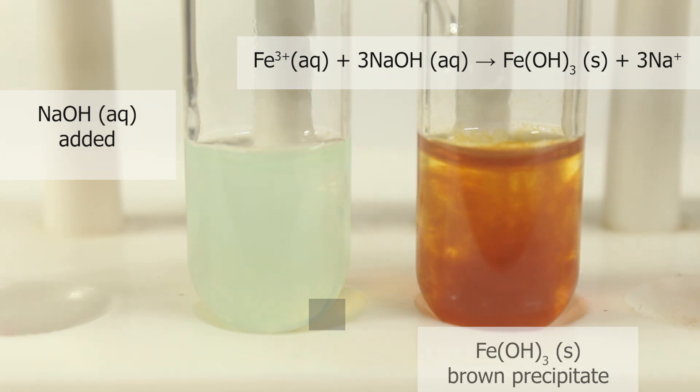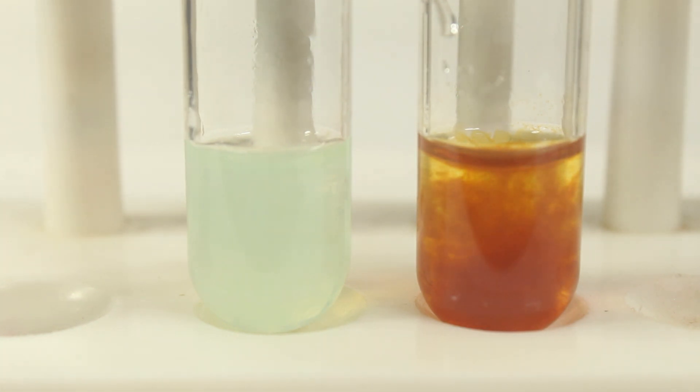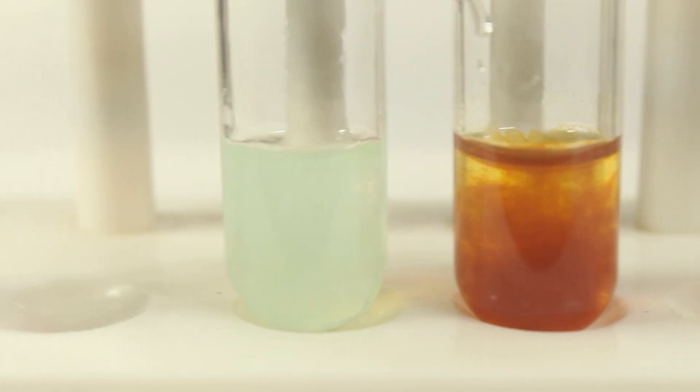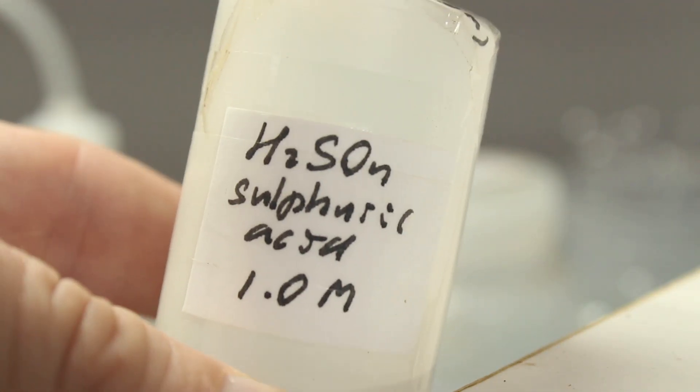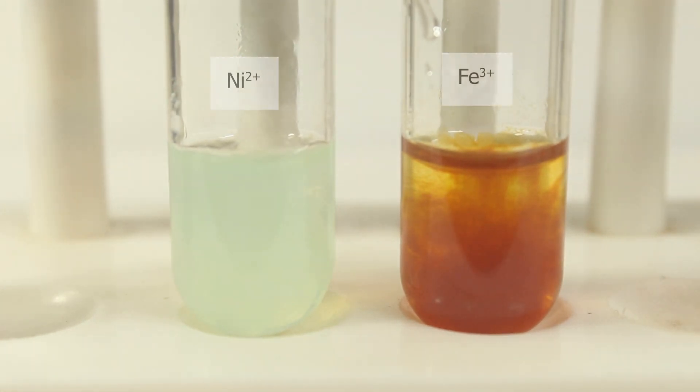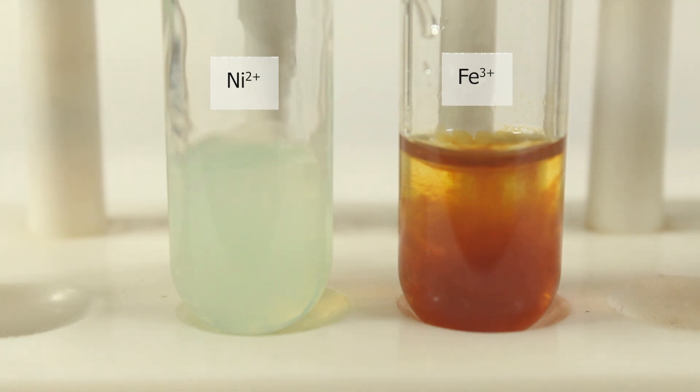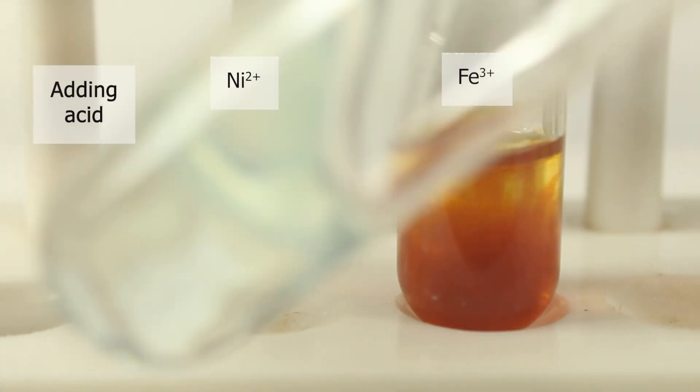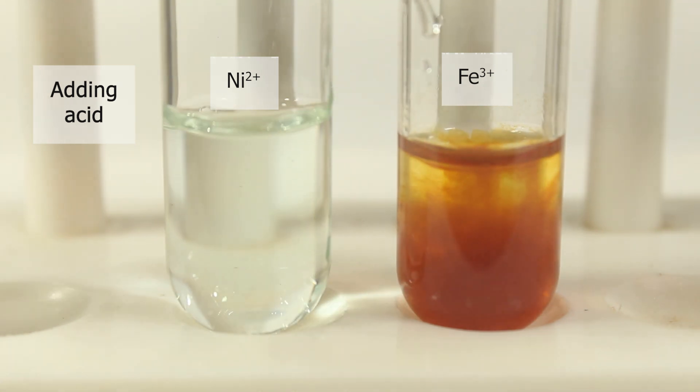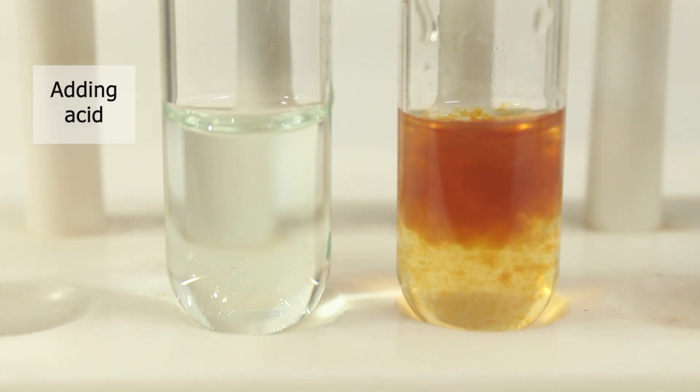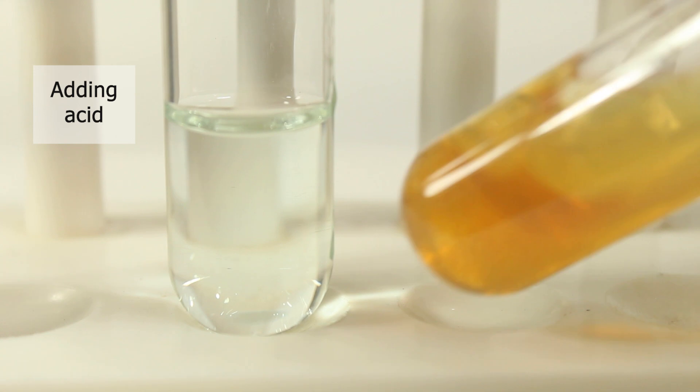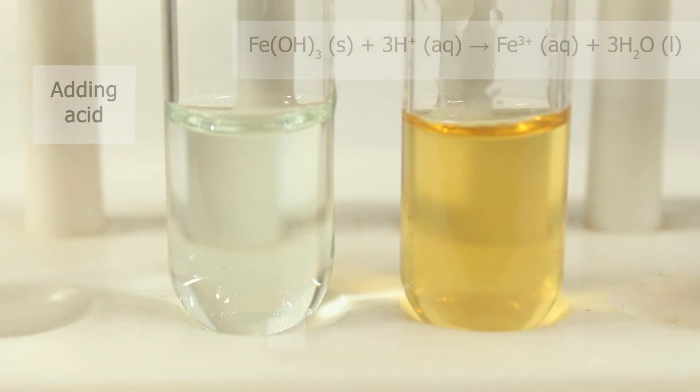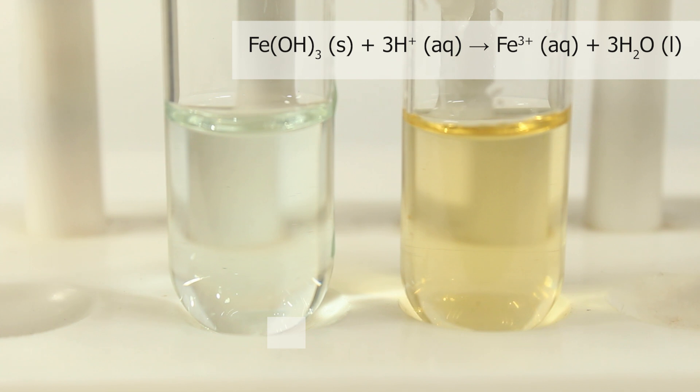We can redissolve it if we add acid to iron-3 hydroxide. Let's take sulfuric acid and see. First start with nickel. Nickel-2 hydroxide readily redissolves in the acid. And here in case of iron-3, we have to wait a little bit. But as well we have just yellow solution back on additional acid.